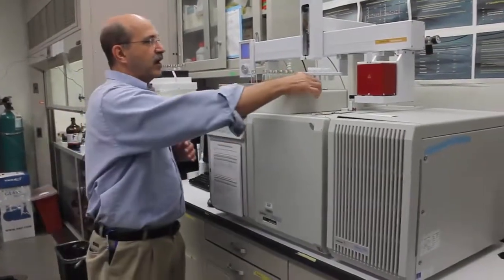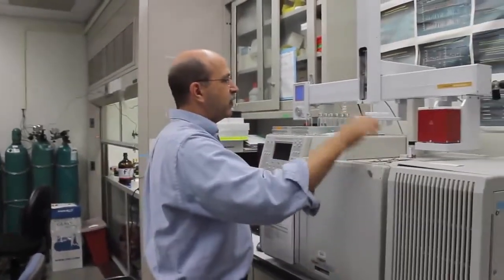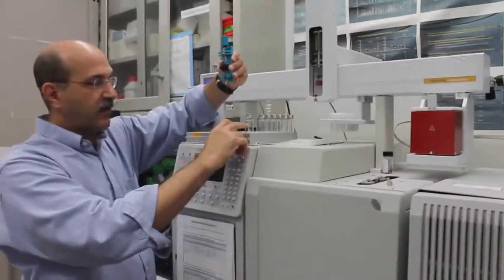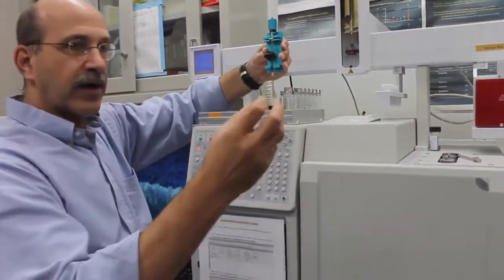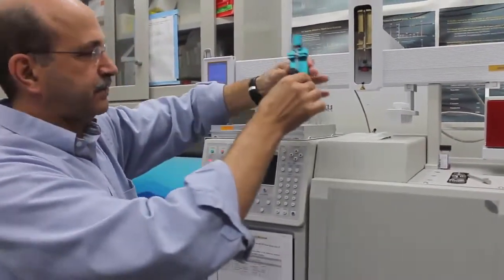We can use a regular needle if the compound is in a solvent. Or we can use something called SPME, solid phase microextraction, which allows us to sample things in the headspace, volatile compounds that when heated are in the vapor phase on their own, or we can put the sample in the water and let the contaminants migrate to the SPME fiber.